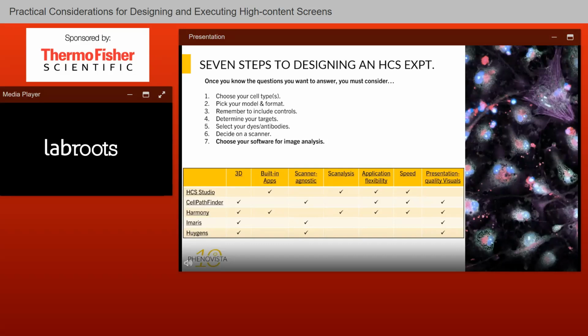And then once you've got your images, some of the imaging systems come bundled with image analysis. Other ones expect you to handle the storage, organization, and analysis of the images yourself, which for some people is their preference. So again, that's an important thing to bear in mind when selecting your system and the approach you want to take.